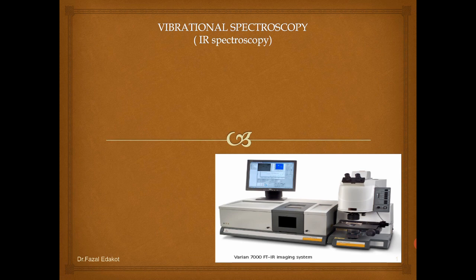Then let us see what is the actual idea behind infrared spectroscopy, where the infrared radiation will influence the energy of the molecule. Infrared spectroscopy is also called vibrational spectroscopy.